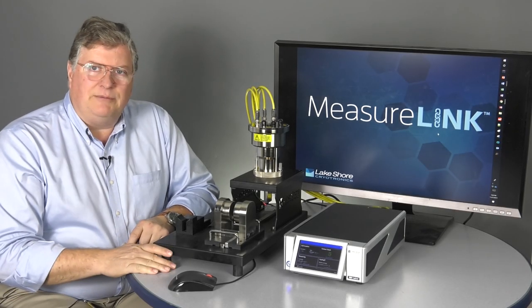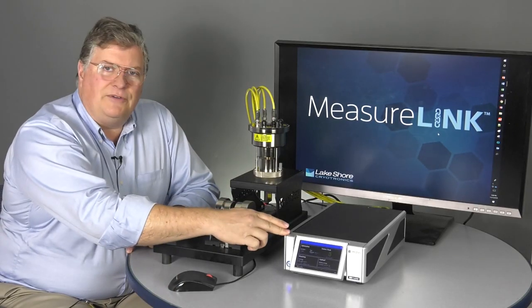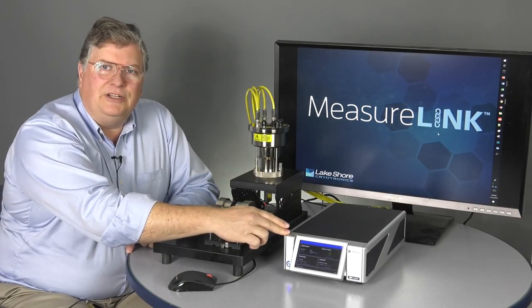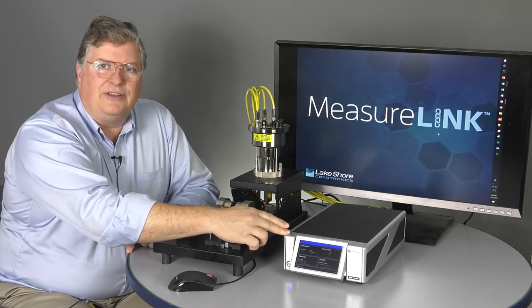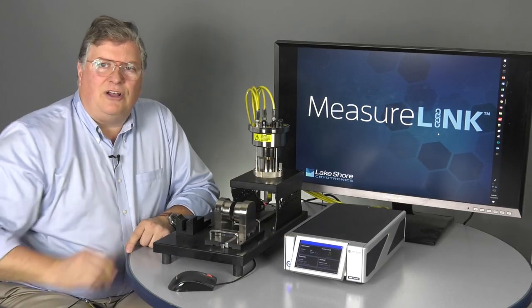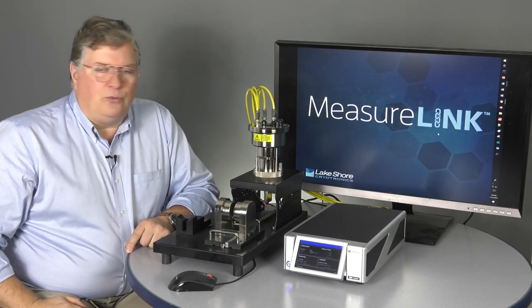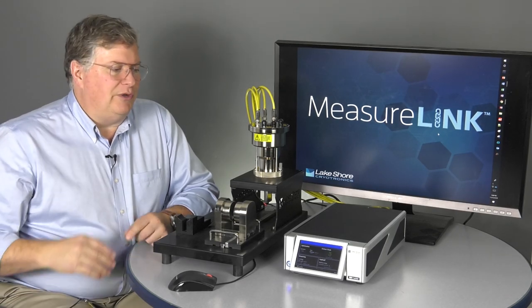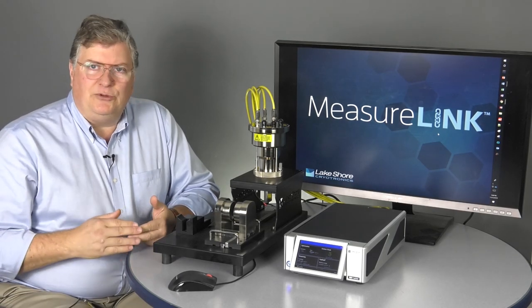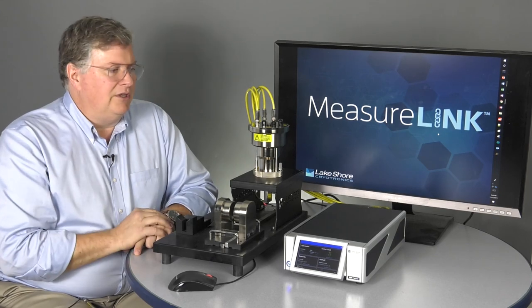Let's look at the components of our tabletop system here. First of all, we have the M91-HR. That's the high-resistance version of our fast hall measurement controller. That's really the workhorse. It's doing all the measurements and doing all the calculations for the system.